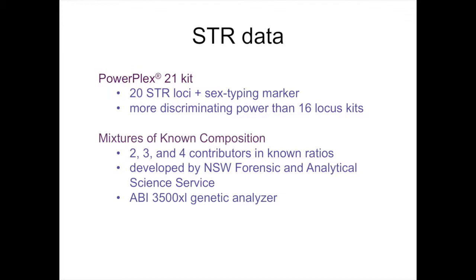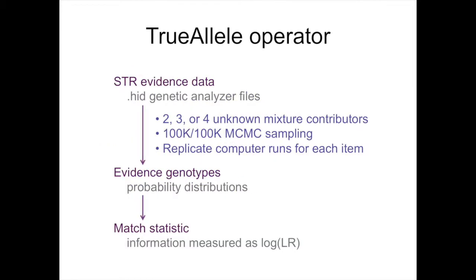3500 XL genetic analyzer. After we received the STR data, a trained TrueAllele operator took the STR data files and input them into the TrueAllele Analyze module, where the peaks were quality checked and then quantitated. Then the operator uploaded the data to the database server and then asked the forensic questions of the data. They asked the computer to solve for either 2, 3, or 4 unknown contributors, depending on the study design.